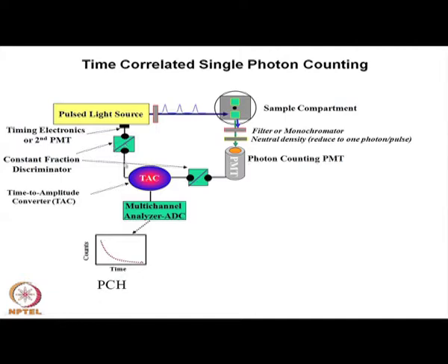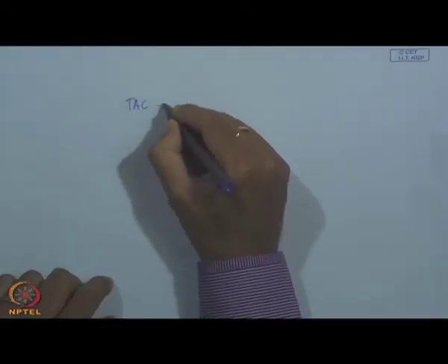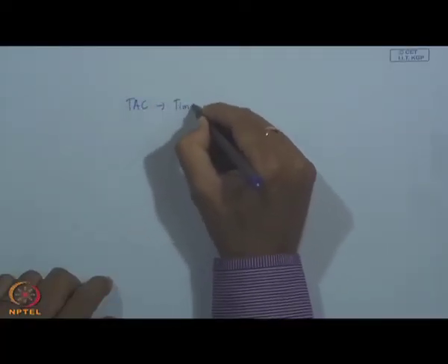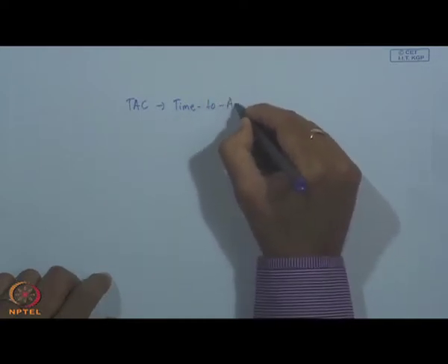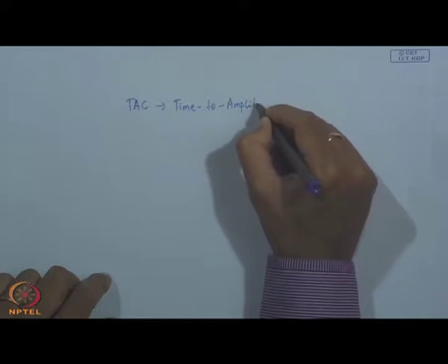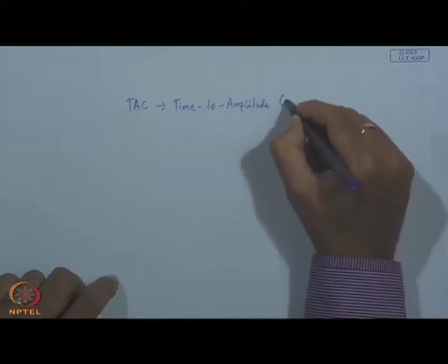It gives a signal to what is called the TAC. TAC is the time to amplitude converter.